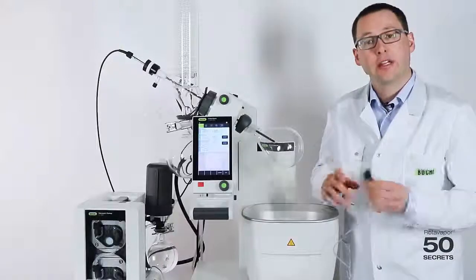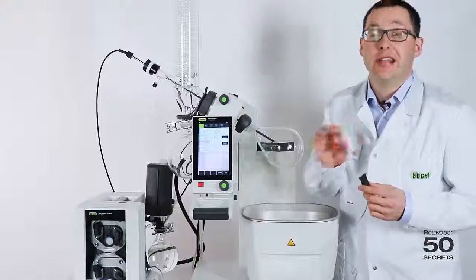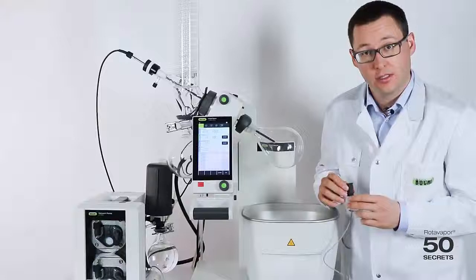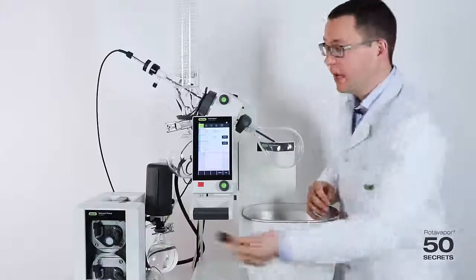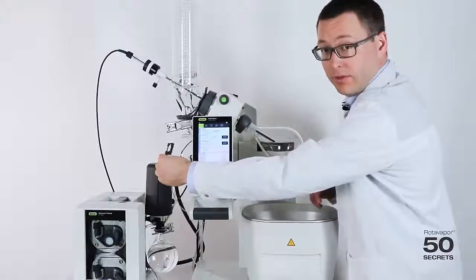I have connected the level sensor to the V300. We use the level port — it's compatible with either the V300 or the V600. I can use this on the receiving flask of the secondary condenser, or on the receiving flask of the rotary evaporator.